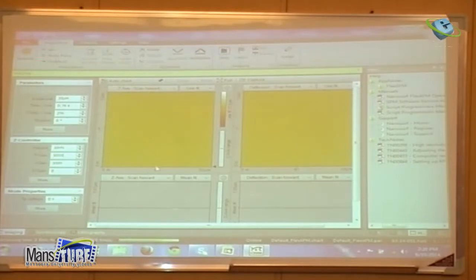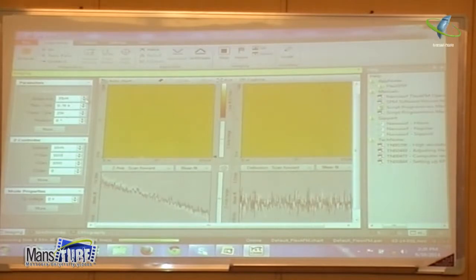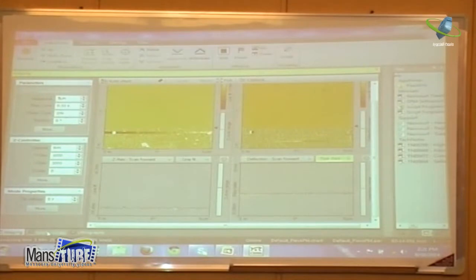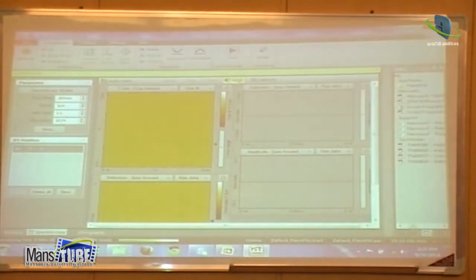Start. You get a value for first, to start with a different value first. Yes, yes, I will show you. I have the image. Then I go, let's say, to spectroscopy. Maybe I can make, let's say, load. Okay, so I have the image here usually, and now I want to do spectroscopy.